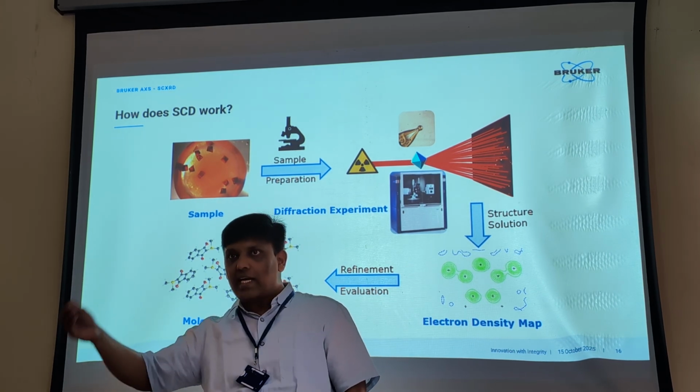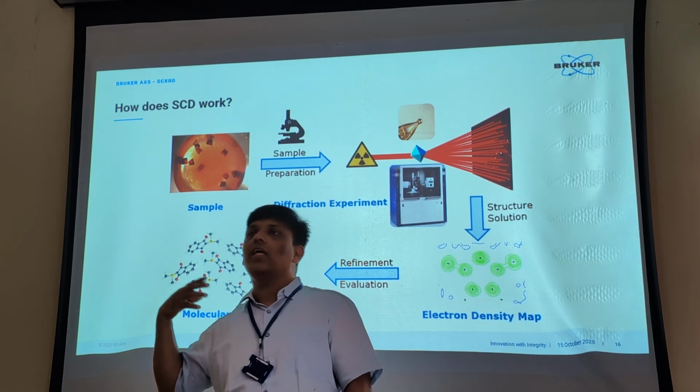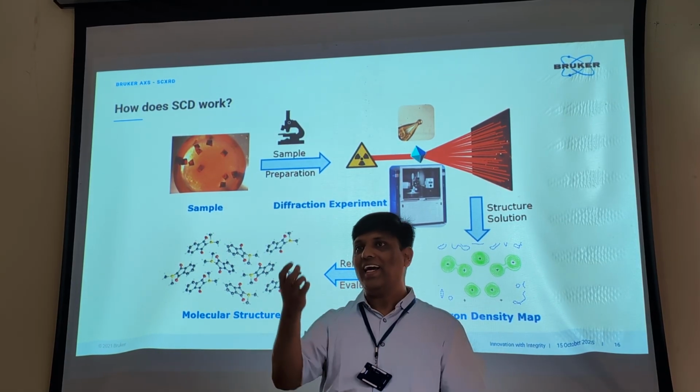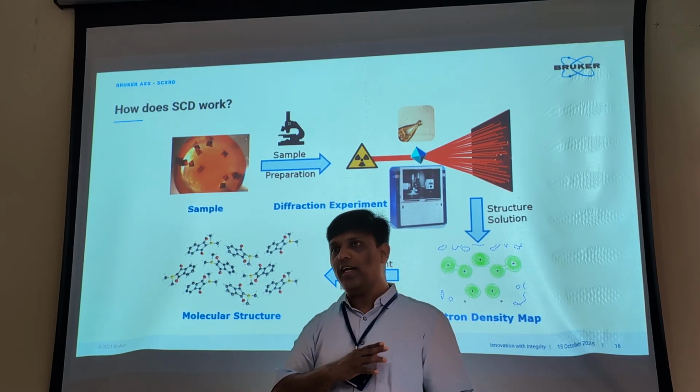If there are some challenges, like twins or disorders, there is always software to handle or tackle them as well. But if your crystal is bad, it is bad. You cannot make it good.